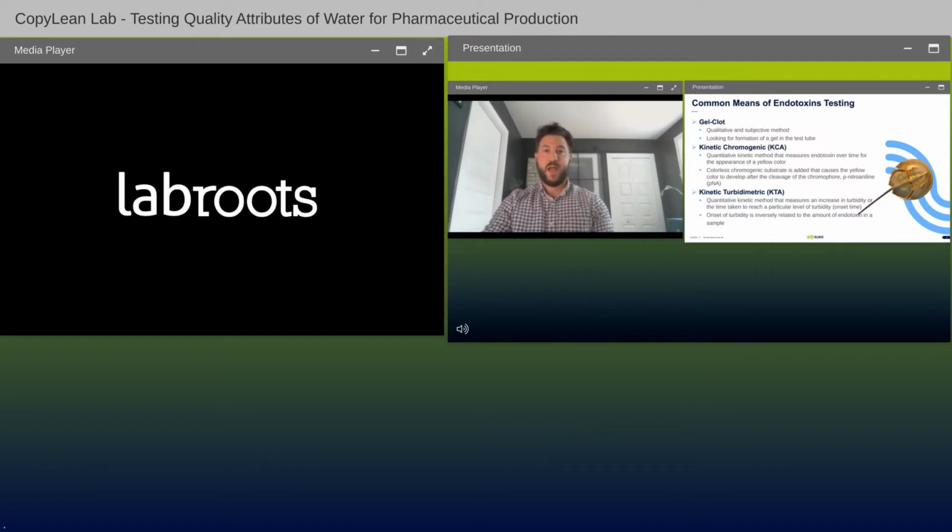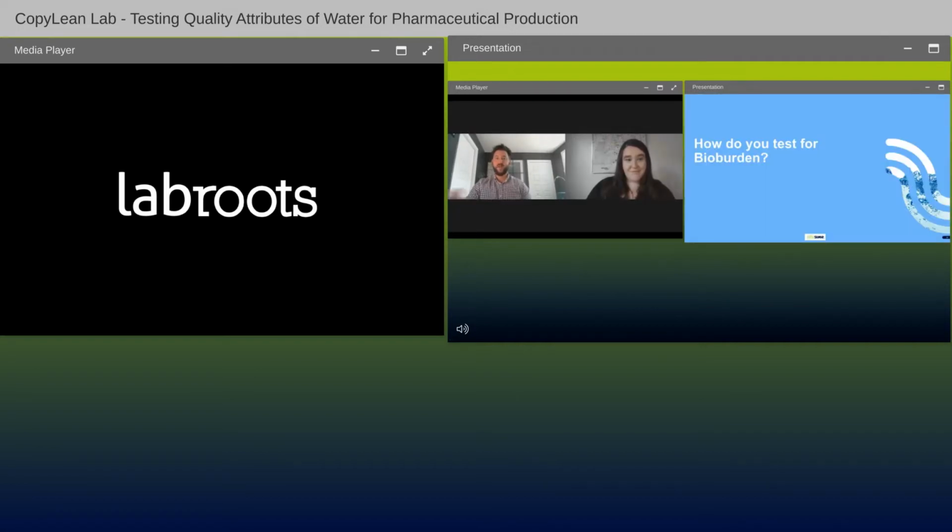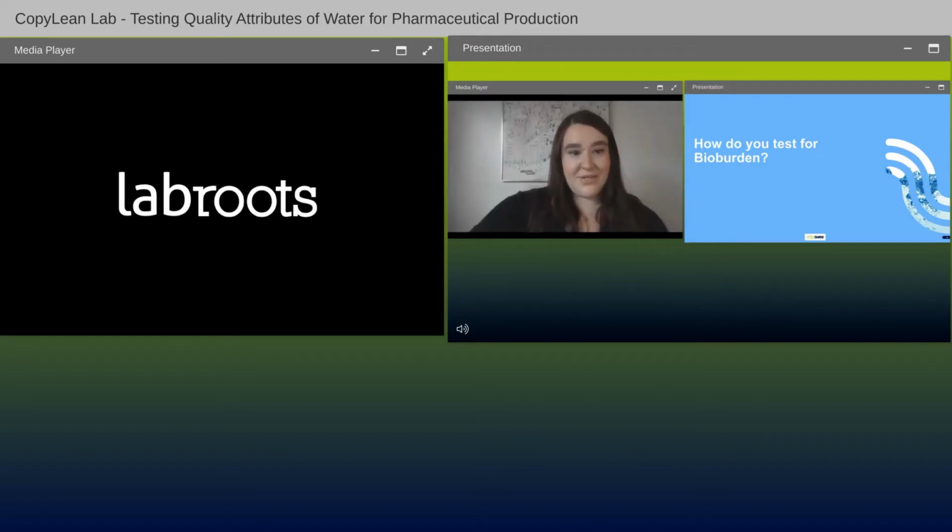Now that we learned a little bit about how we currently test for endotoxins in the industry, I'll pass it over to Briana and she can explain how we currently test for bioburden. Thank you very much, Hayden. I'm going to get into how we test some bioburden.